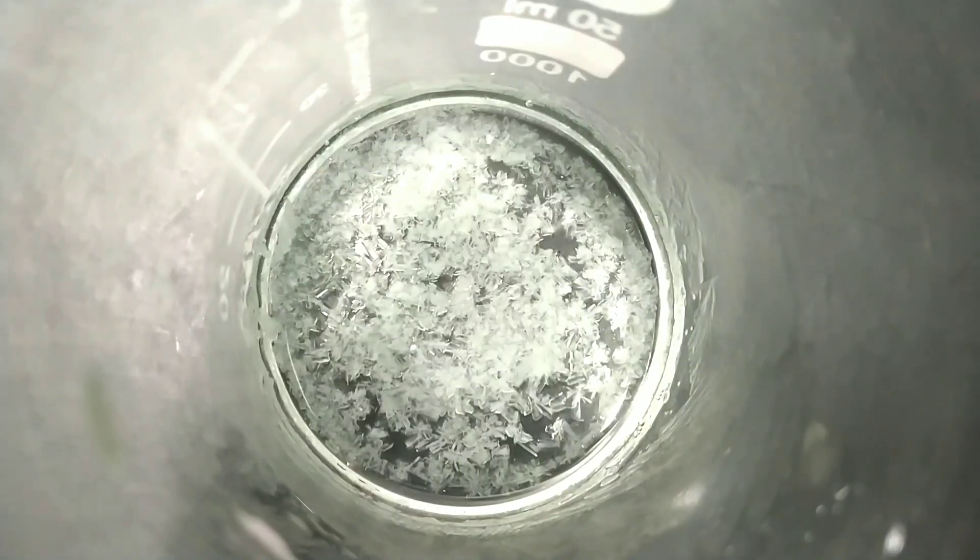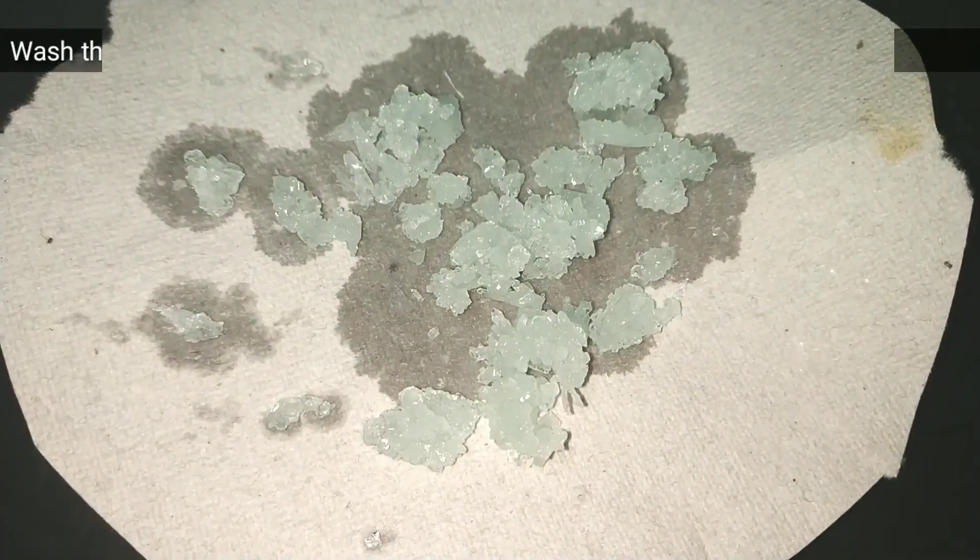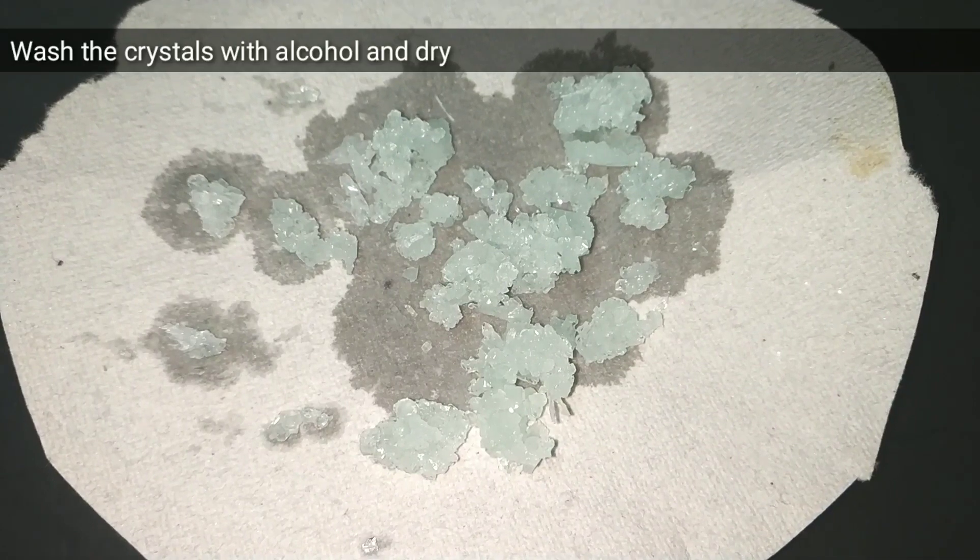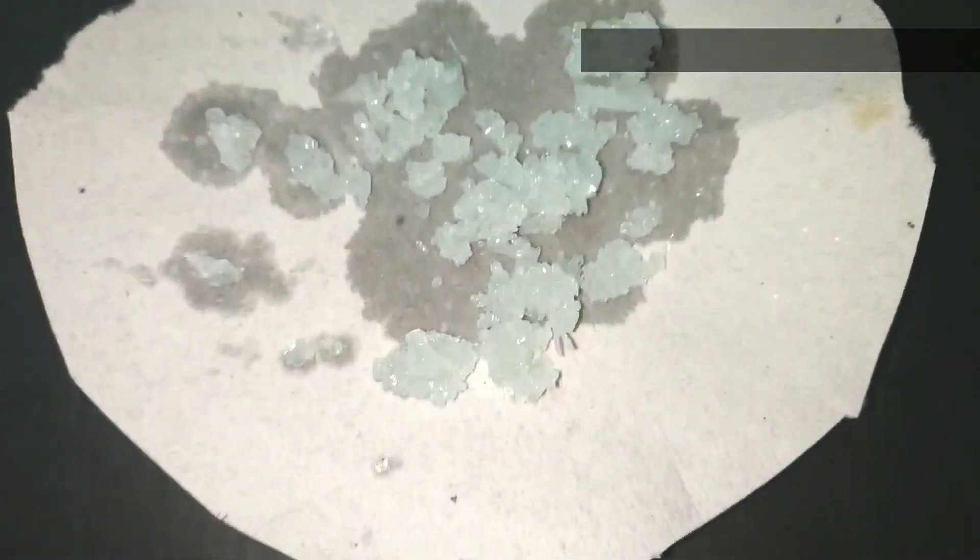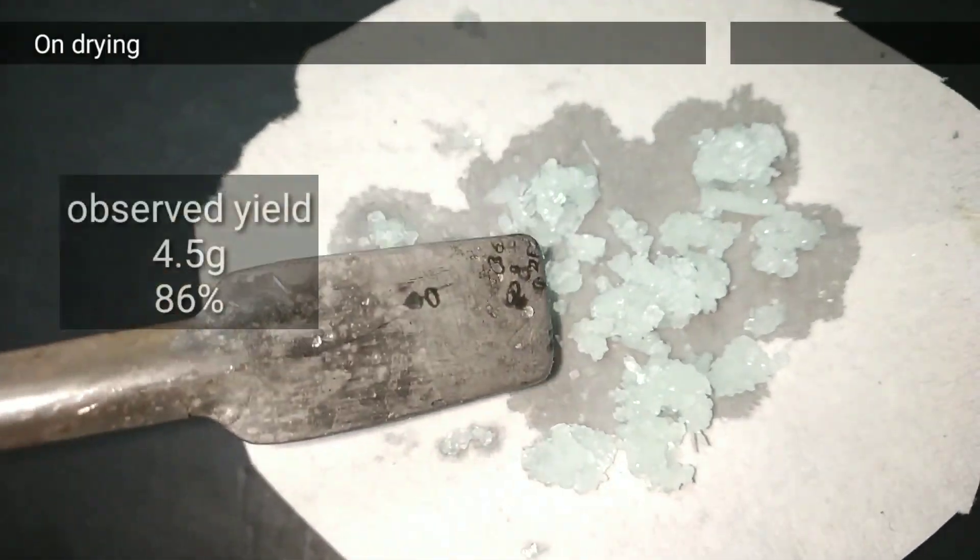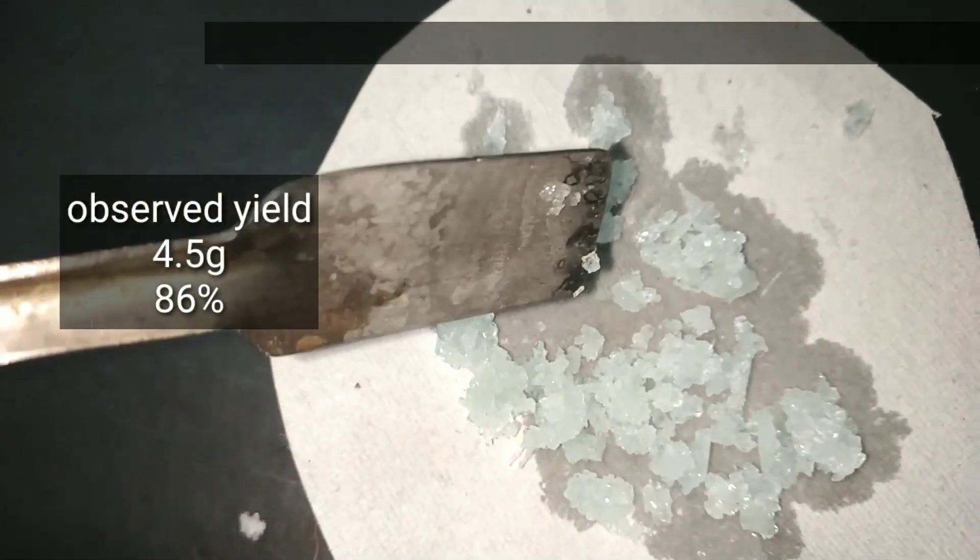Now we can decant the solution and wash the crystals with alcohol and we dried the crystals. I got about 4.5 grams of ferrous ammonium sulfate or ammonium iron 2 sulfate.